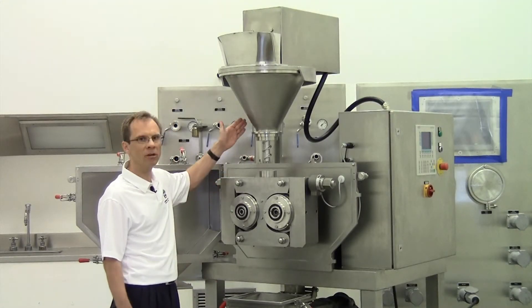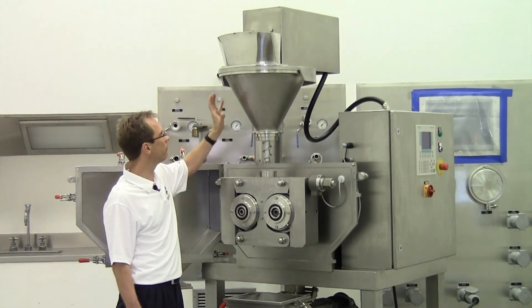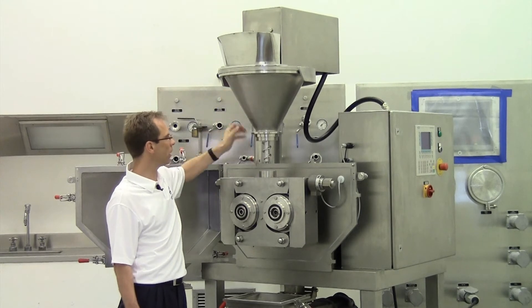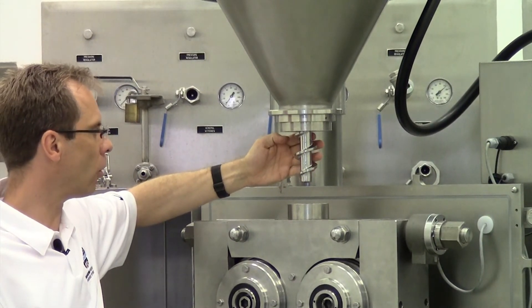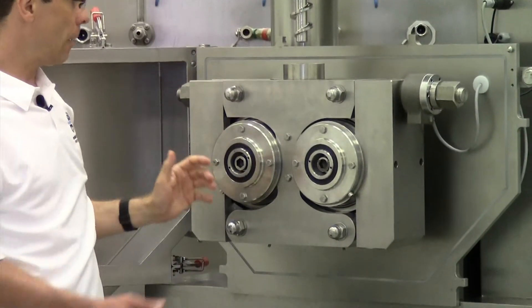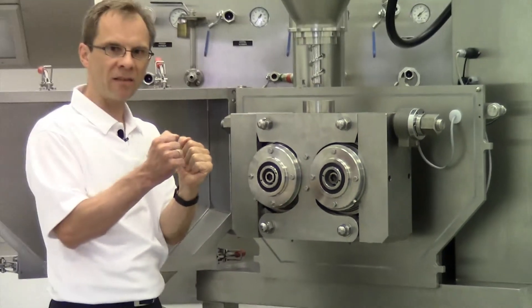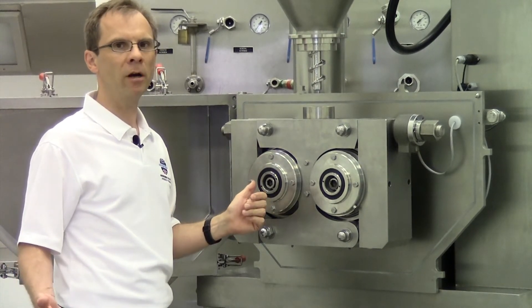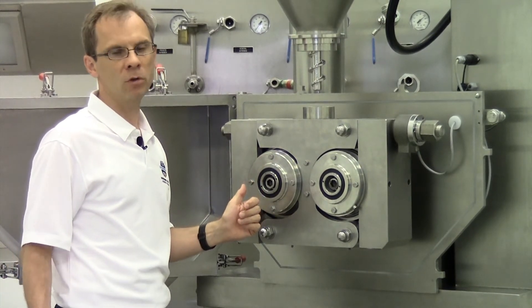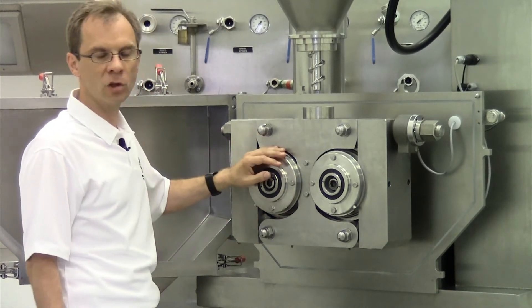When we do compaction inside the compactor, we feed in powder. The powder will be transferred and conveyed with a feeding auger to the rolls. Between the rolls the material will be pressed very hard. The maximum pressing force of this machine is 30,000 pounds, which is rather high for such a small machine.